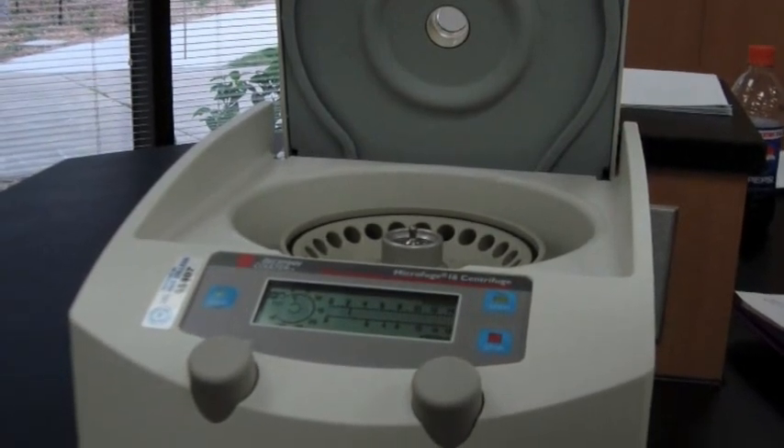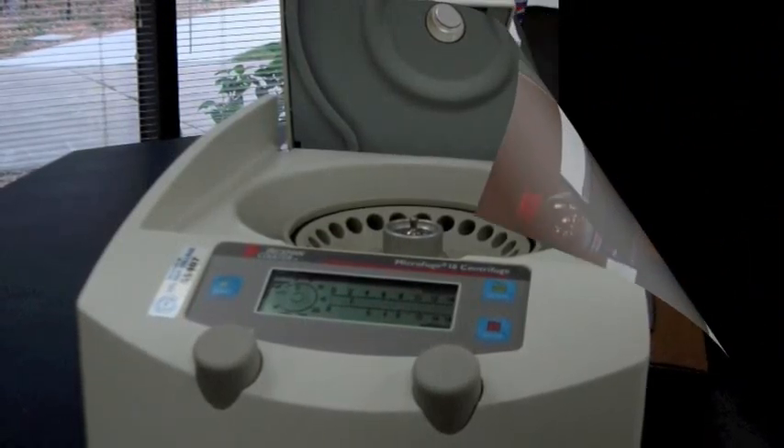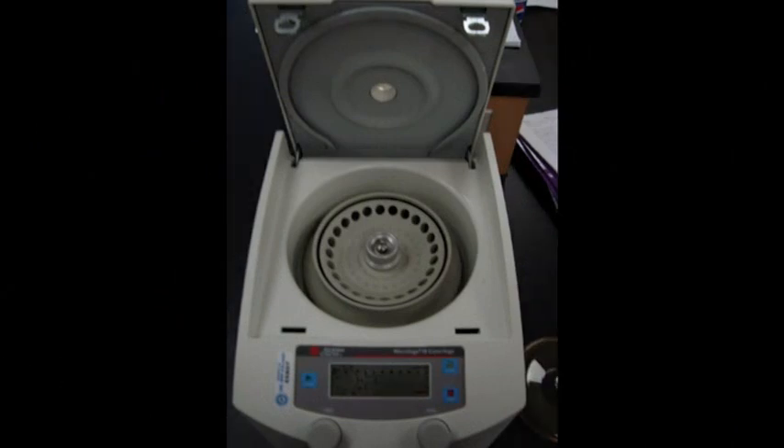To operate the centrifuge, you place your test tubes on equal weights into opposite slots. If the centrifuge is unbalanced, it will not spin properly. The next step is to secure the lid, close the machine, and set the dials. The left dial sets the time — how long you want it to run — and the right dial adjusts the RPMs, or rotations per minute.